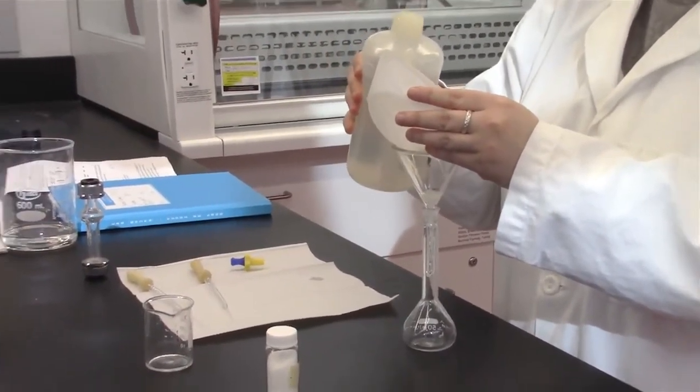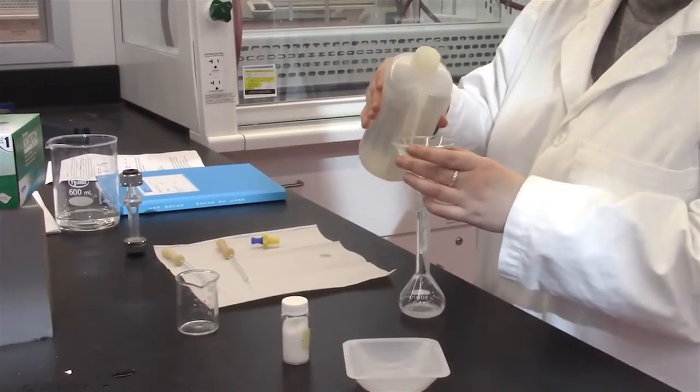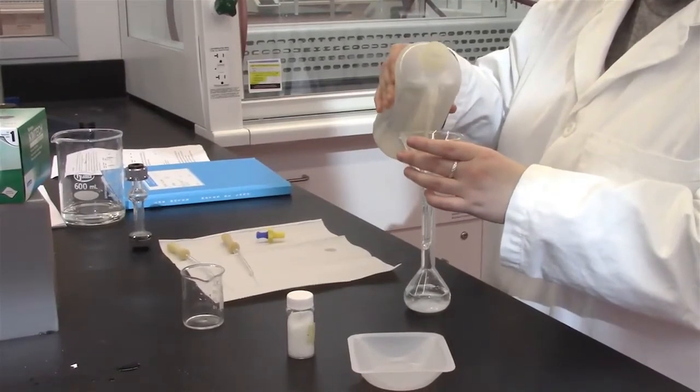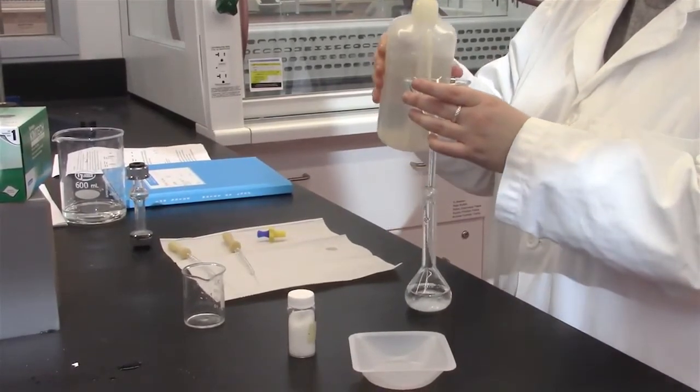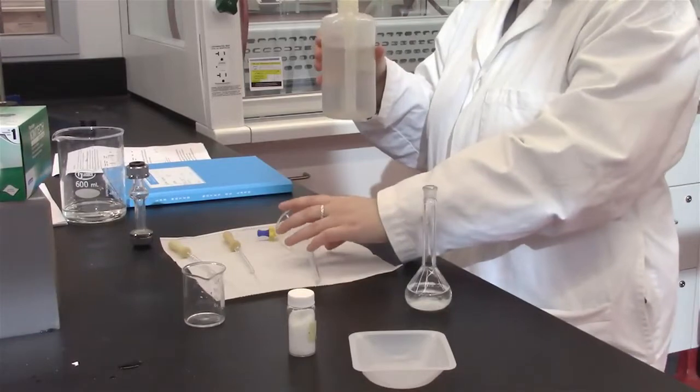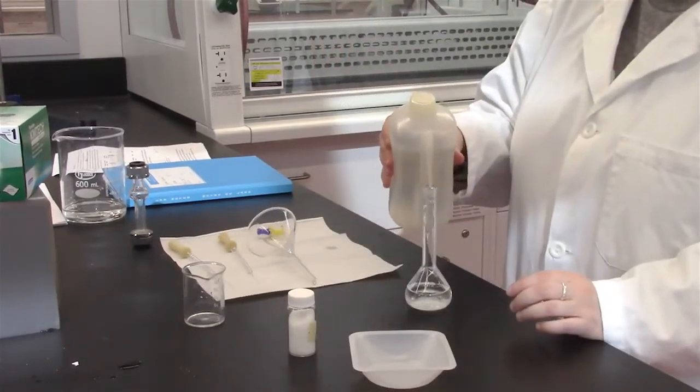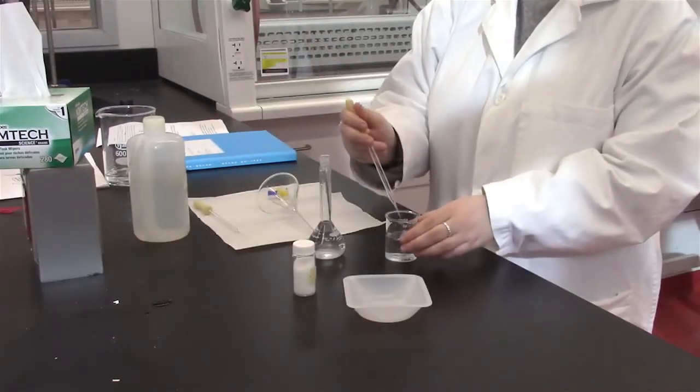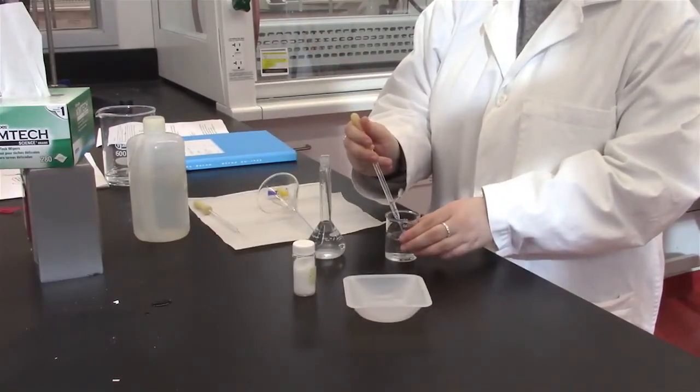Rinse the weighing tray and funnel using deionized water. Using deionized water, fill the volumetric flask to its midpoint. Fill the volumetric flask to the line with a glass pipette.